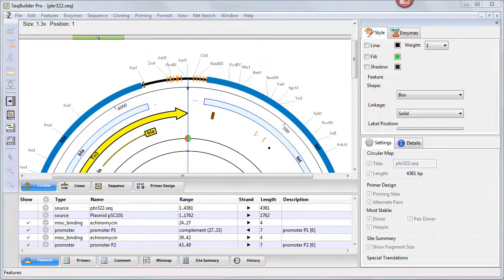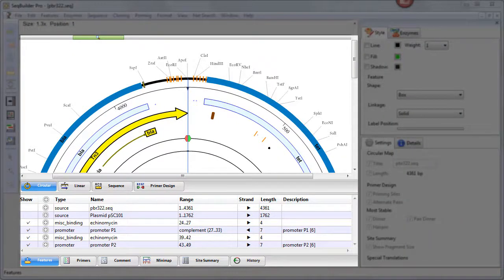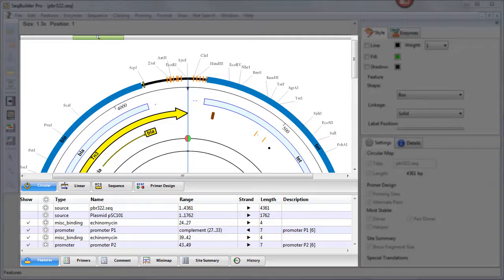After opening a sequence in SeqBuilder Pro, the main portion of the document window displays two views by default. The default views depend on whether the sequence is nucleotide or protein.